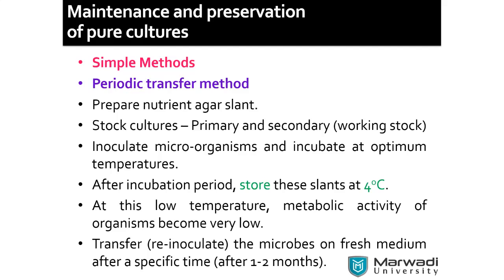Over there also we have to check it out. Sometimes it may happen that it also gets contaminated. There are so many reasons behind it. Maybe a handling error or any power fluctuations. So stable power supply is required. It's mandatory when we are working with preservation.